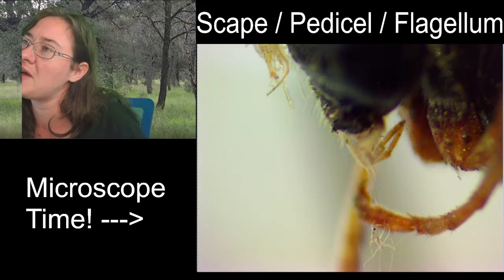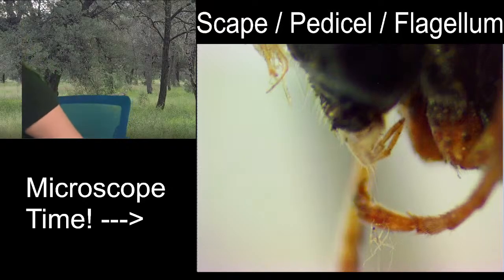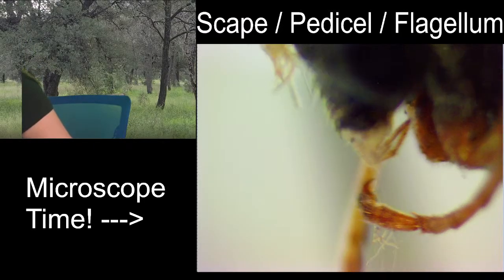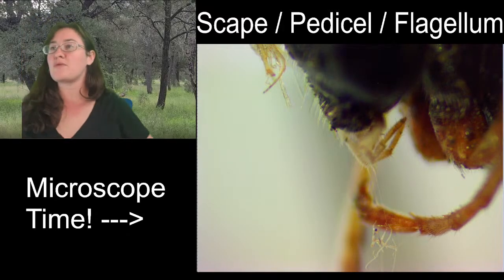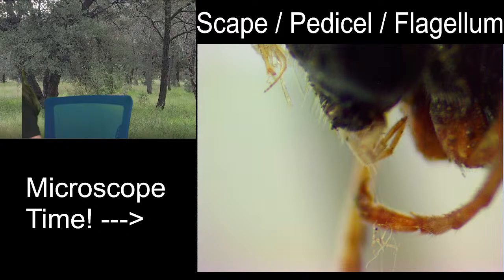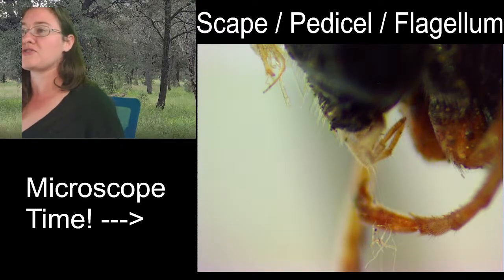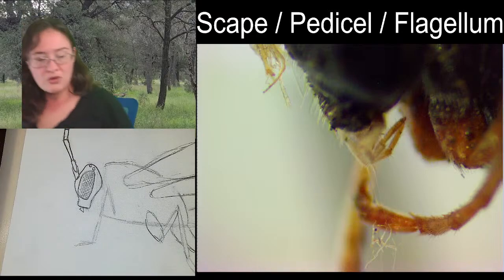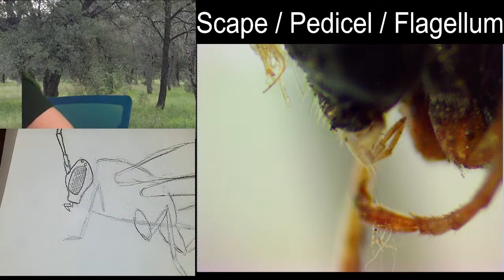So this is what it looks like from the side. Oh, wait a minute. These palps may not be three-segmented. We could see three segments from the front, but when we turn it to the side, we actually see more. They come down from the head, and they have a very small triangular segment, and then one segment that goes forward, one segment that goes backward, and then three more. So it looks like five or six segments. That's a whole lot more than three. But its palps were pushed backward, so from the front we couldn't see those last ones.